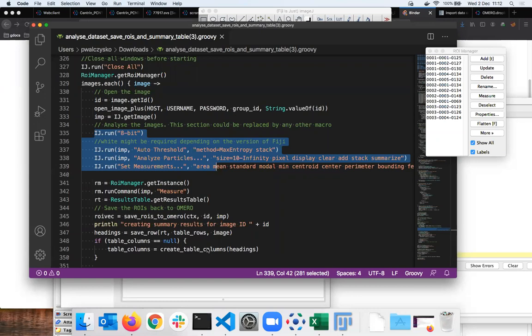And if you are interested in only loading a given plane, sorry, my video is off, as Peter was indicating, when you were viewing an image in the web, we're loading one plane at a time. You can also do that if you want to only analyze a plane or a given channel. We have plenty of examples of that.